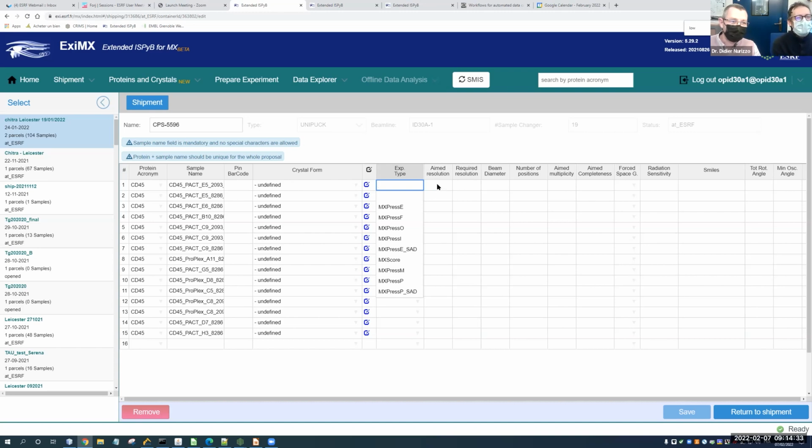That's true. Resolution is an interesting thing you can provide us. It means that basically we do the characterization, and more than the characterization, all the mesh, etc., to a 2-angstrom default resolution. Which means that if you don't say anything, we bring the detector to 2-angstrom resolution, and we do the mesh, the X-ray centering, and the characterization to this resolution.